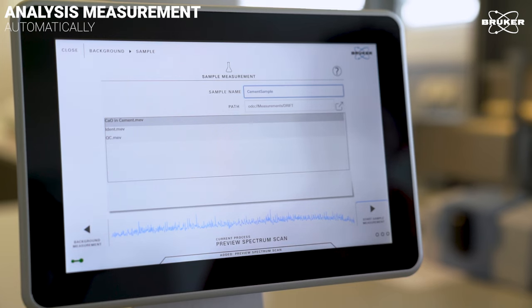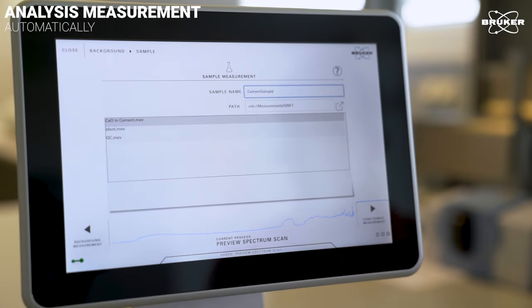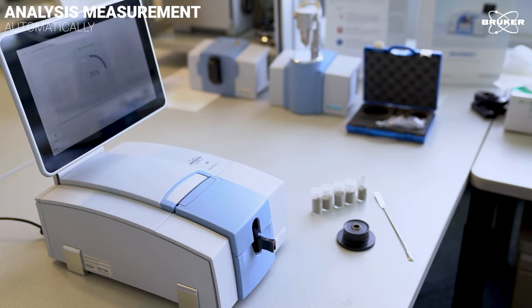Immediately, a preview IR spectrum will be shown in the software and after checking it, we can start our measurement with just one click.